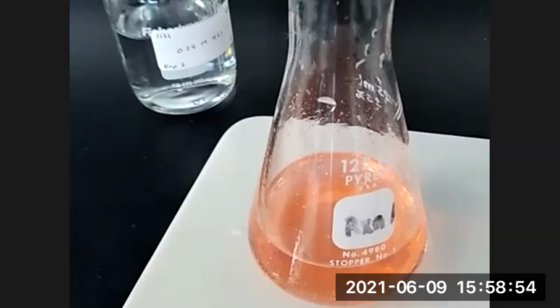And so when you get your value of the volume of HCl, you'll write it on the board, and other groups will write their values. So then you can plot volume of HCl versus mass of sodium bicarbonate. And that's how you perform the second part of lab 2.